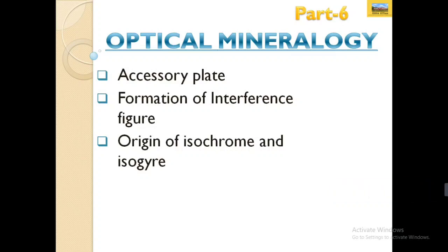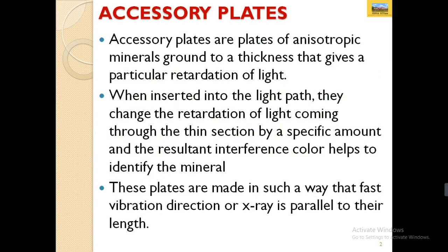In this video lecture, we will discuss accessory plates, formation of interference figure, origin of isochromes and isogyres. Now the first topic is accessory plates. Accessory plates are generally used for formation of interference color that helps to identify a mineral.